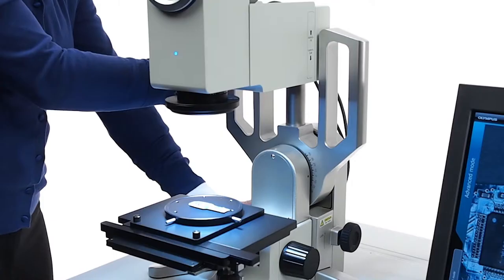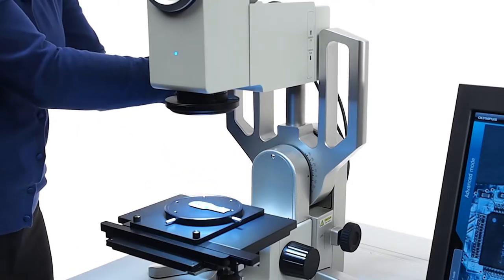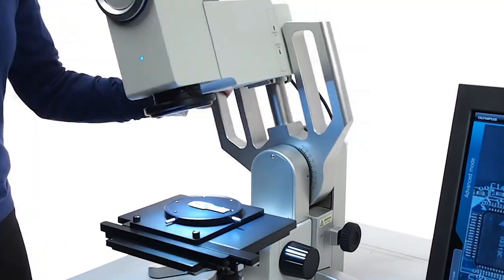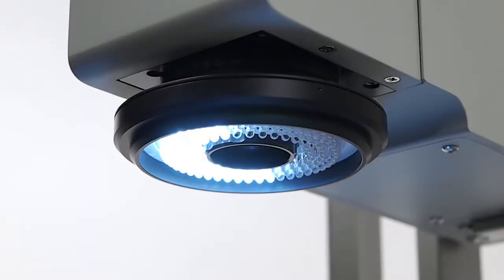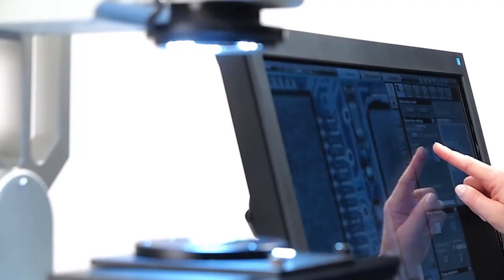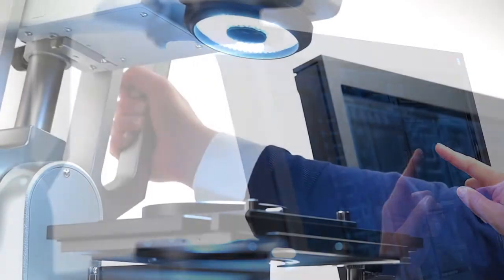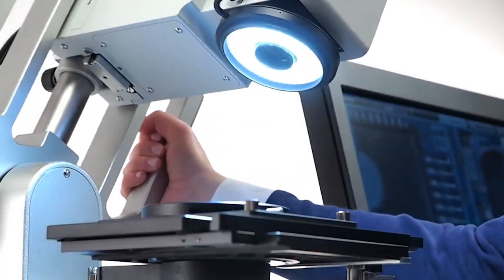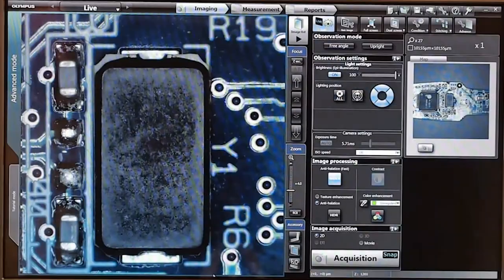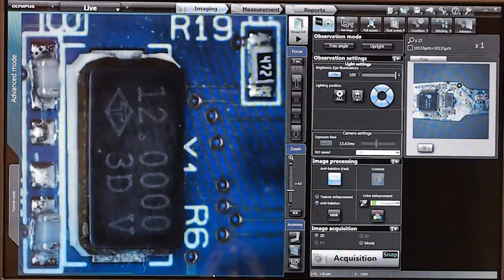The DSX 110 has free angle tilting and an LED ring light so you can rotate the illumination around your sample to view and capture images of scratches and defects.